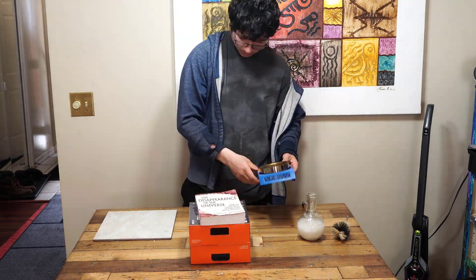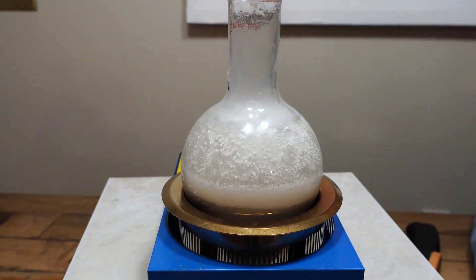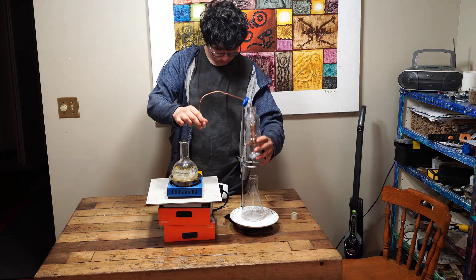Next we're going to boil the styrofoam in order to remove any residual acetone that didn't get removed during evaporation. Now we're going to start the pyrolization process. Using a wattmeter, we're going to measure how much energy this takes and if it's efficient or not.